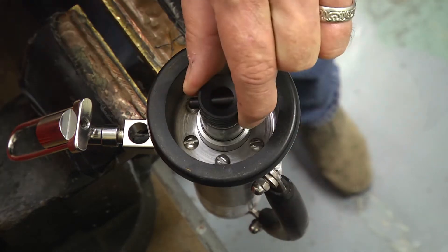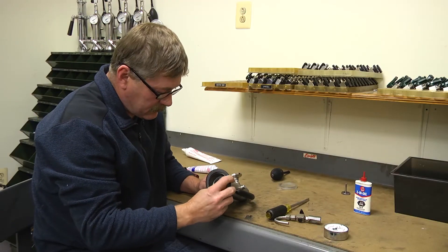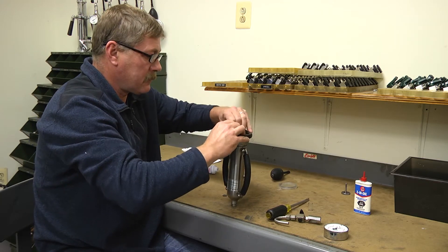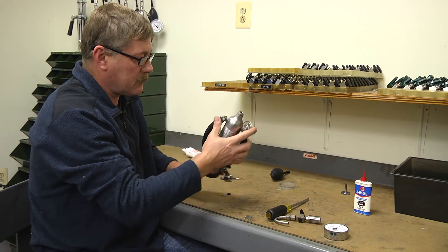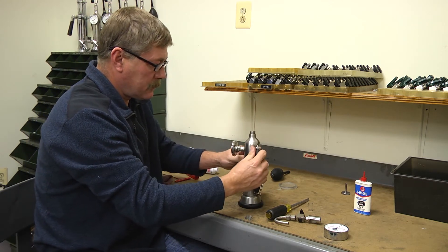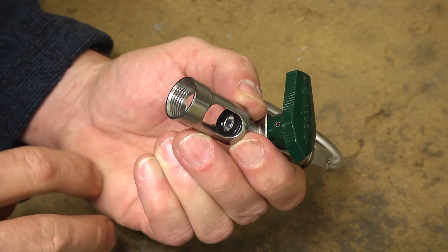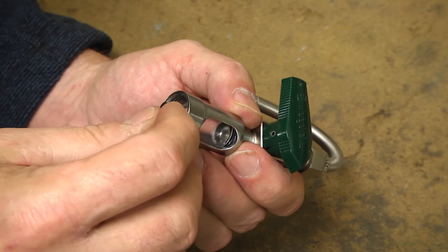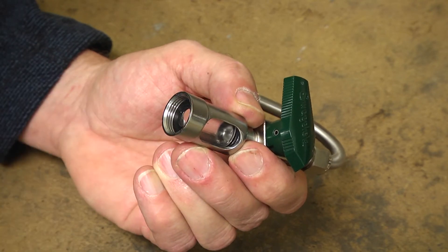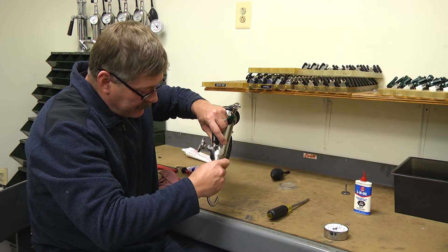Work the piston in and out, making sure no binding has occurred. Replace the base shield. Holding the sight glass cage assembly, install the top gasket, the sight glass, and the bottom gasket. Thread the sight glass assembly to the volume meter body till hand tight.